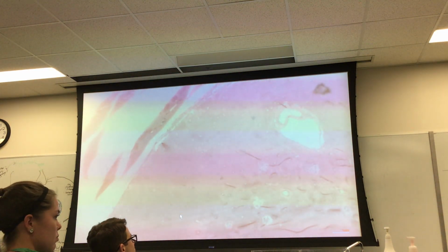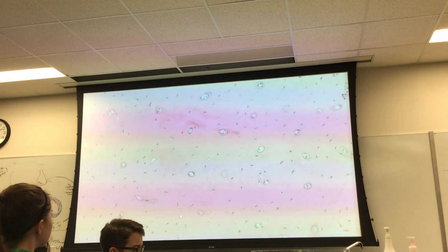But this issue of bone is definitely a good thing to think about. So here's a big tendon. Here's what's going on. You've got a tendon running right through muscle. So, let me drop the mag even further just so you can find this easily. Yeah, here's bone.